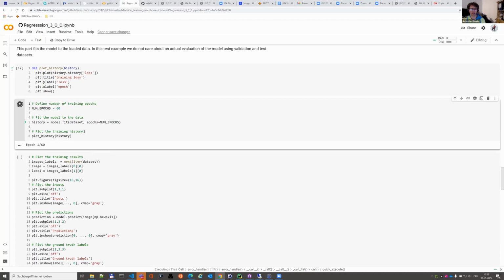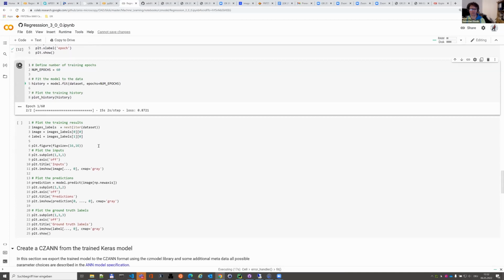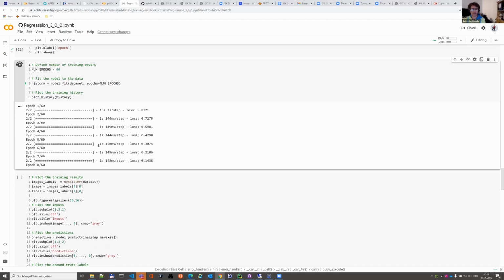This will take a few seconds. Okay, one epoch. It used to be a bit far. Okay, no, only the first one took a while. Okay, let's see.